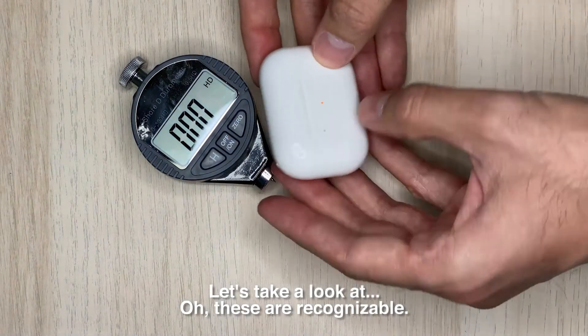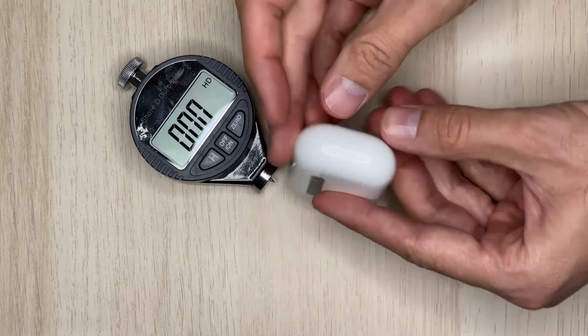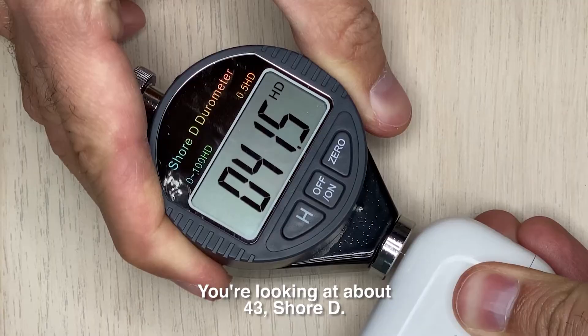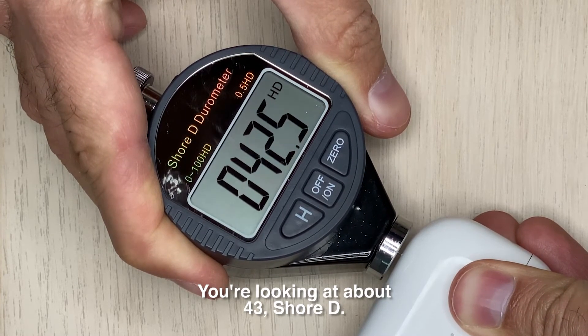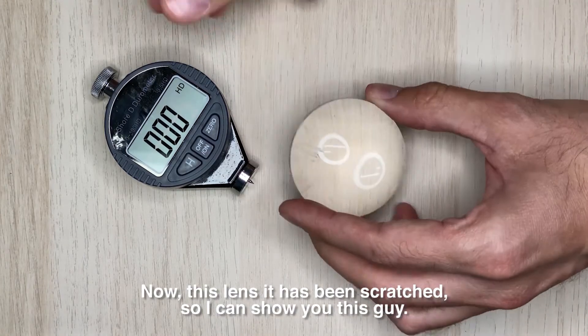Let's measure another object — we'll do that on the very bottom. That's reading about 43 Shore D. Now this lens has already been scratched, so let's measure its hardness next.